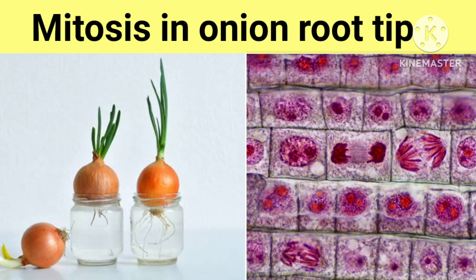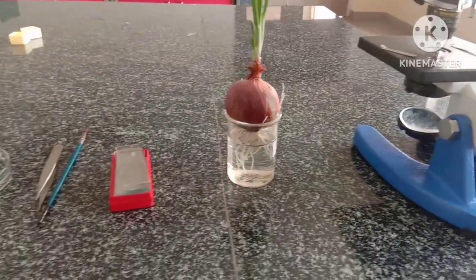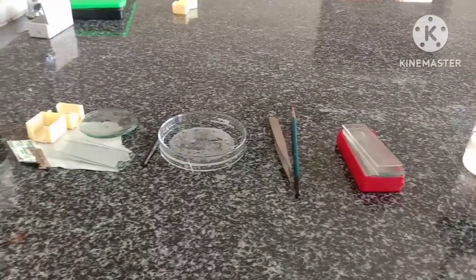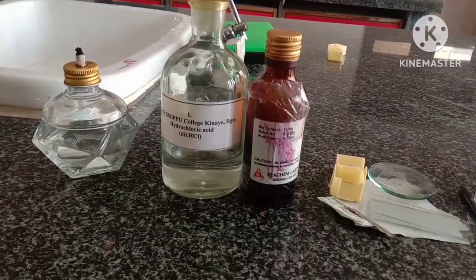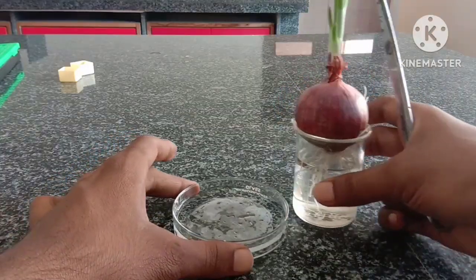Hello students. Today's practical is the study of mitosis in onion root tip. Requirements: a compound microscope, onion bulb with roots, slides, brush, needle, watch glasses, cover slip, acetocarmine stain, one normality HCl, spirit lamp, etc. Now we will see the procedure.